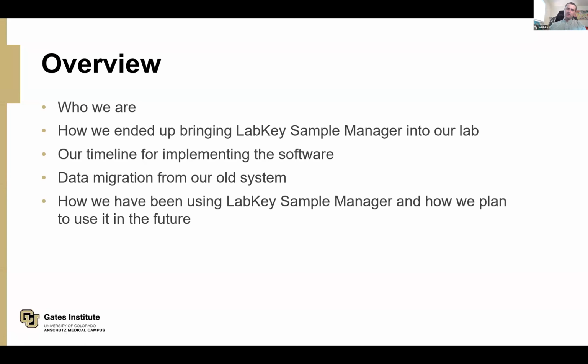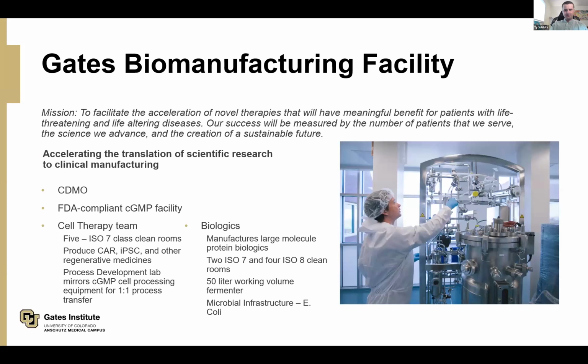Then I'll talk about how we've been using LabKey since implementing it and how we plan to use it in the future, because LabKey offers a whole litany of functions, and we want to make sure we're utilizing 100% of this software to make our lab as efficient as it can be and make the lives of all the operators and workers at our company the easiest.